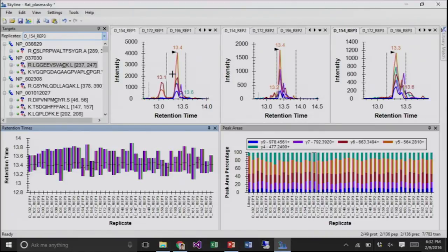There's also a really important thing about processing SRM data when you don't have ideal selectivity. So with ideal selectivity, all you see is your peak. It looks beautiful, and there's nothing else. But sometimes you'll see something like this over to the left. That's another peptide, right? And those other peptides, those interfering peptides, when they don't coelute with your peptide, they still provide you with a landscape. And they have the same property of retention time stability as your own target peptide.